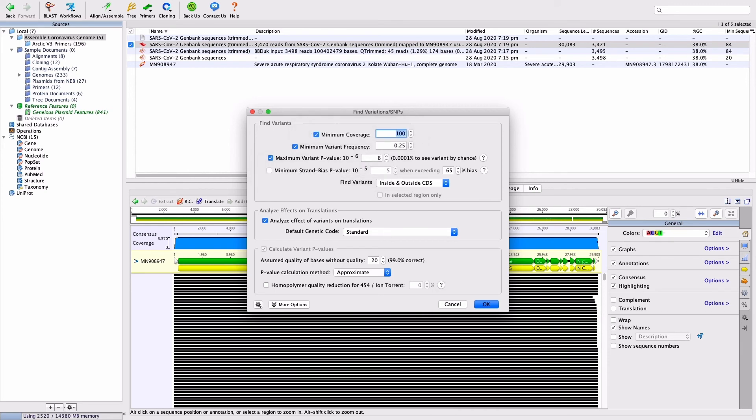If the Strand Bias setting is left on, some variants may be missed, as the tiled amplicon approach can result in portions of the genome being covered by only forward or only reverse reads.